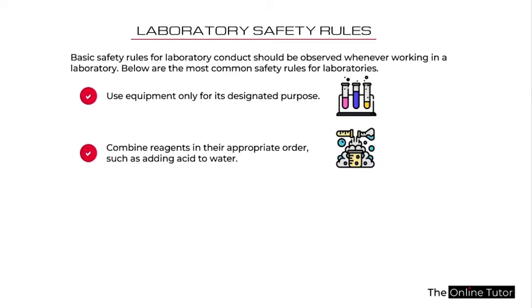Combine reagents in their appropriate order, such as adding acid to water. You don't want to add water to acid. The reverse will generate a reaction that produces tons of heat, and that can cause an explosion. So make sure you read your laboratory manual. Know what you're expected to do, and follow the procedures in the manual. Don't go and use your own way. Use the procedures that your supervisor has provided for you.